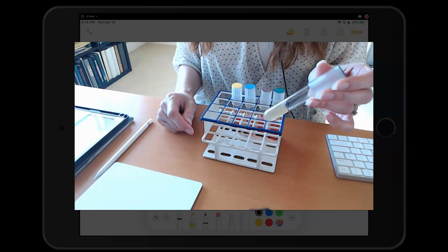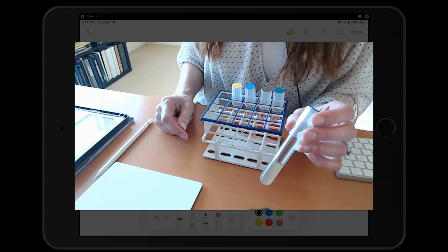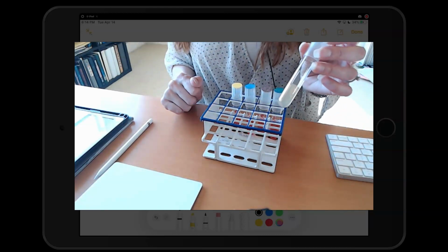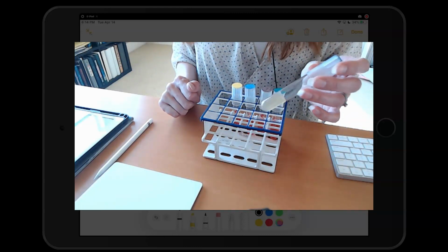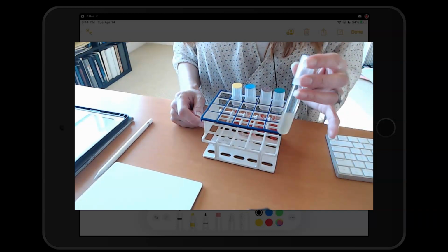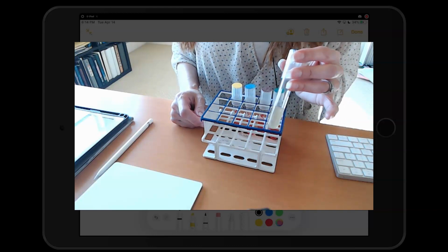Remember, they both end with ase, amylase, gelatinase. So gelatinase would be an exoenzyme that the bacteria produces inside of the cell to be secreted to the outside and break down gelatin, which is a protein. It breaks it down to its monomeric units, which would be amino acids, and that way it's easier for consumption.